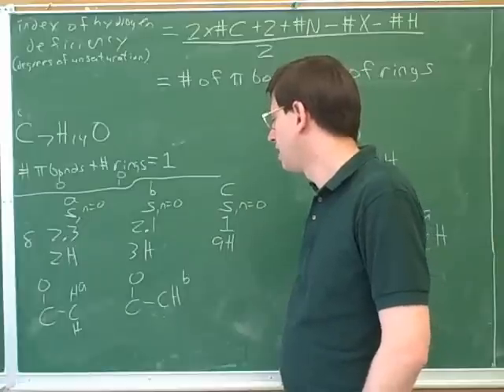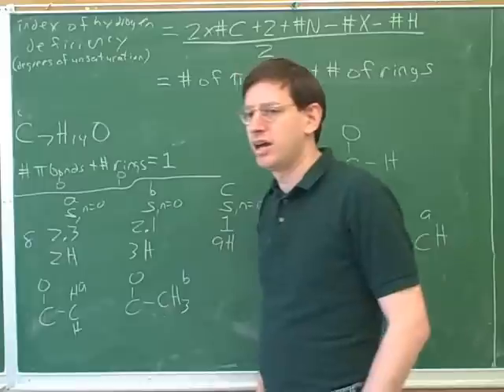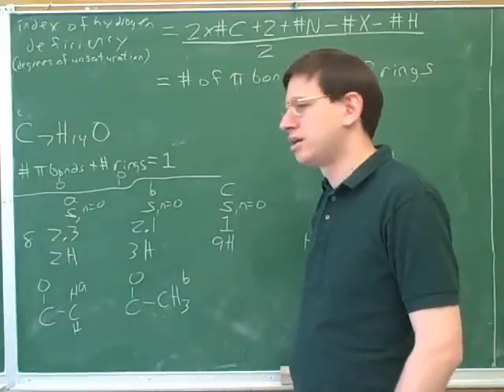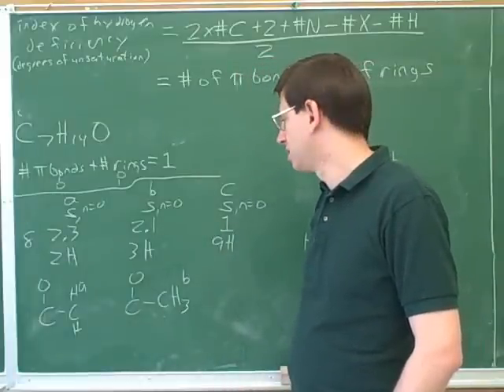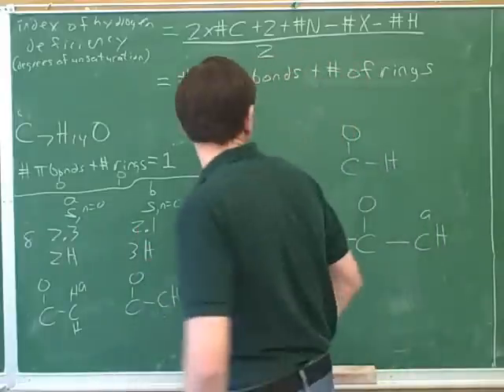Is that possibly a methyl group? Looks like a methyl group, absolutely. How do we know the carbon is attached to the oxygen? From the chemical shift.